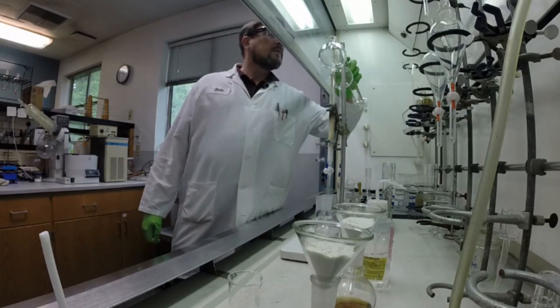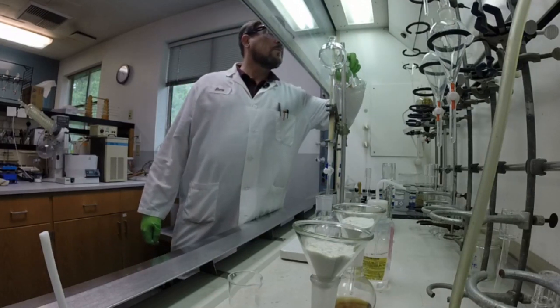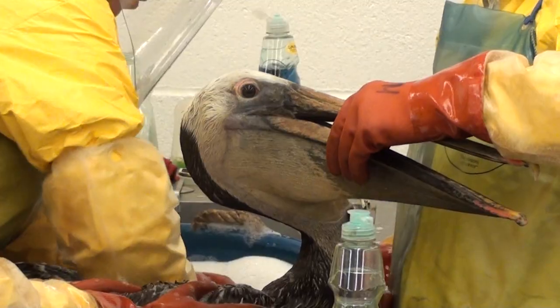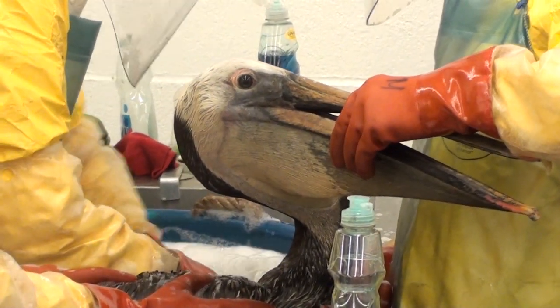The lab is one of only several throughout the country, which has been instrumental in identifying the source of petroleum contaminating waterways and wildlife for more than 20 years.